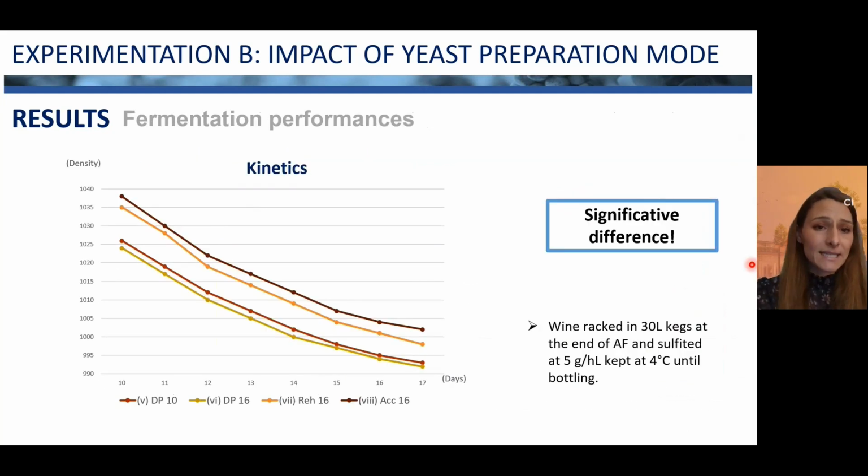So here we have the kinetics of these 4 scenarios, and we can see that actually the 2 direct pitch scenarios were indeed faster to ferment.